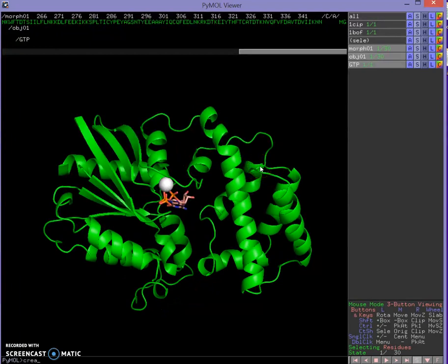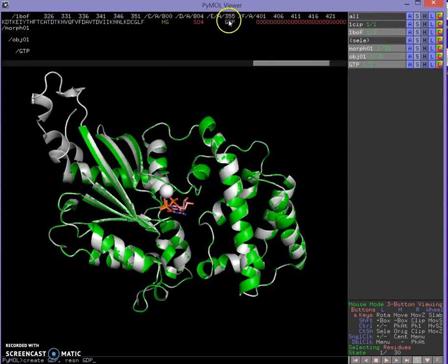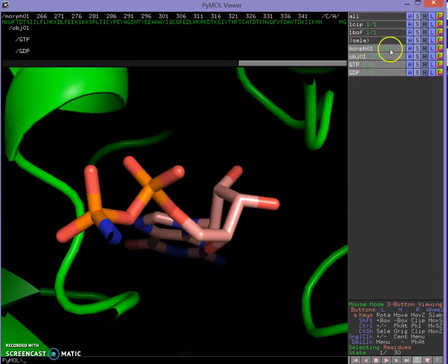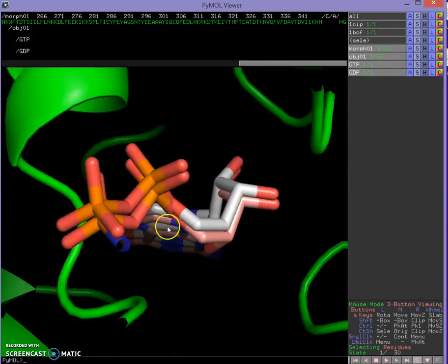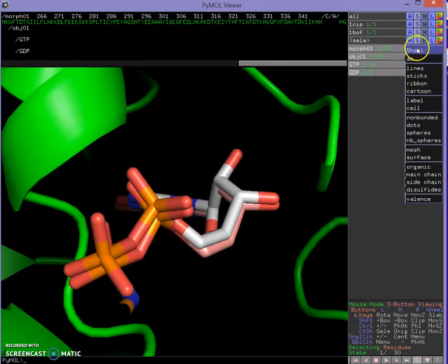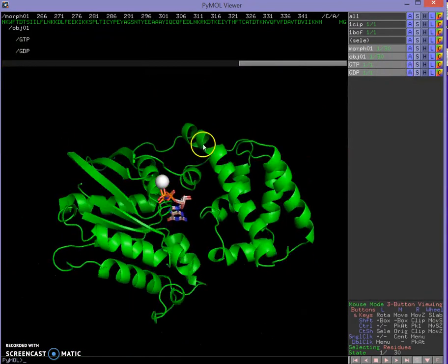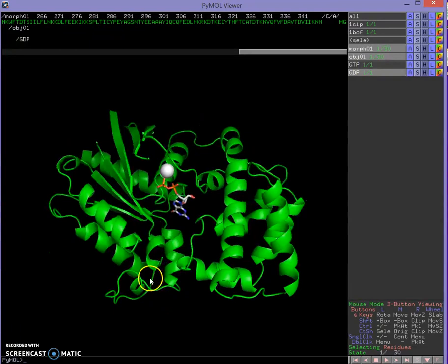Now I'll do the same thing with GDP: 'create GDP, resname GDP'. Looking in our 1BOF, GDP is the ligand there. I'll turn that off. There we go — in the active site we have a new object called GDP, and I'll show that as sticks as well. There's a little bit of change between the two positions, which is okay. I'll orient back on the morph and zoom out. Since I'm starting in the GDP-bound form, I'll turn off GTP.